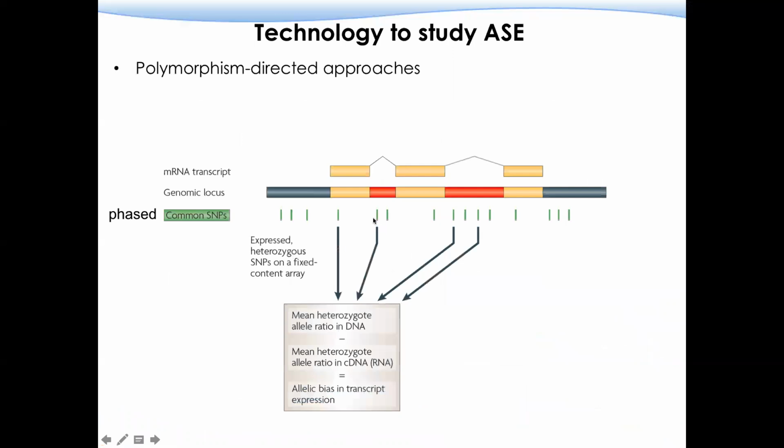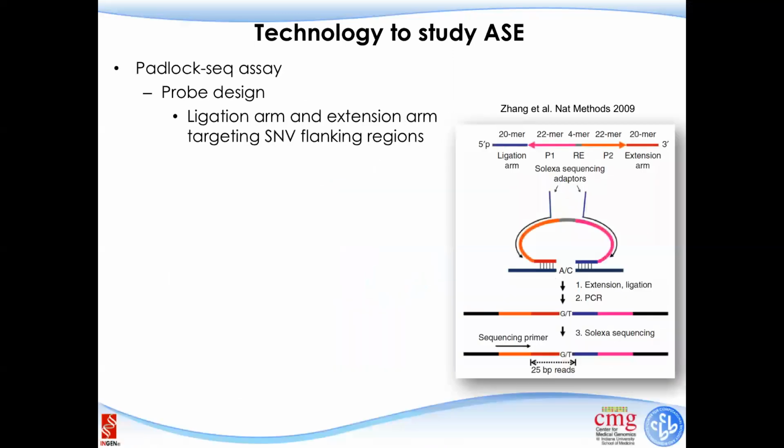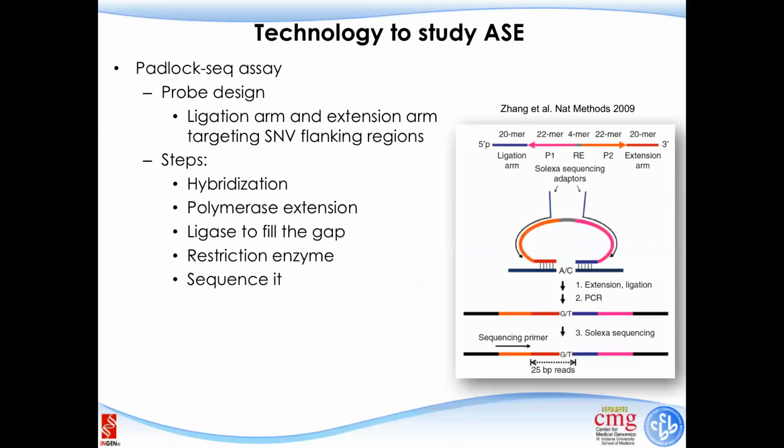The SNP is on the gene body and on the introns. If we have the DNA sequence, we have the DNA sequencing or the genome information of the difference of the two alleles. So we can definitely use this information to infer the allele-specific expression. And there is also some other technique that I just put here. It's good to read, I think, but I may skip it due to time issues.